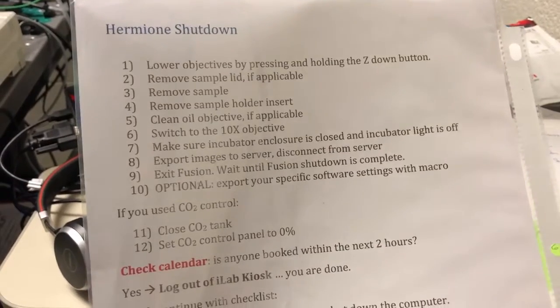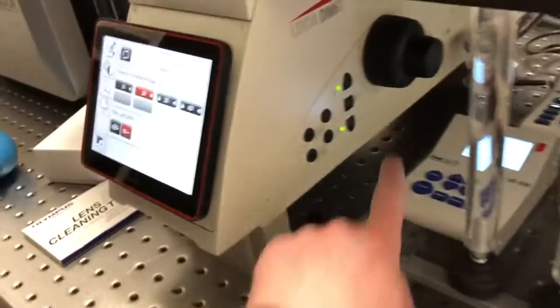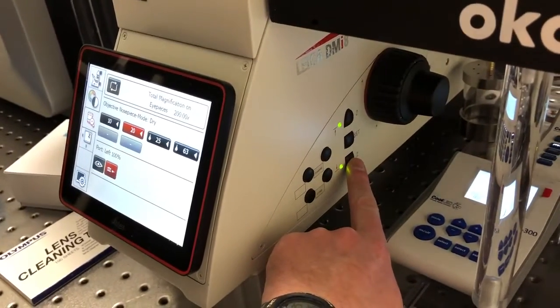The first step of the shutdown instructions is to lower the objectives by pressing and holding down the Z button. That is this button on the microscope. If we press and hold that button the objectives will go down and move away from the sample.